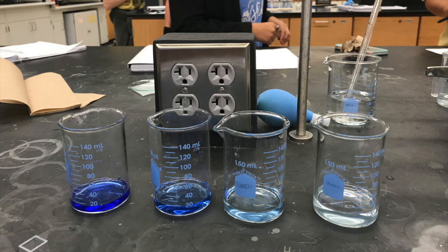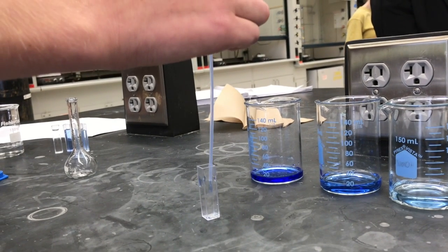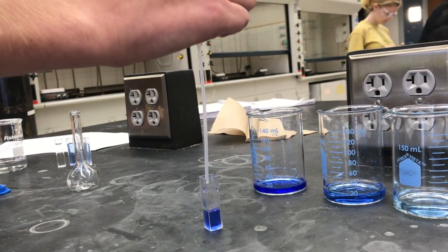Now you have your stock solution, your dilution 1, your dilution 2, and your dilution 3. Make sure you do not mix these up. The next step is to pipette your solutions into a cuvette. Complete this procedure as shown.